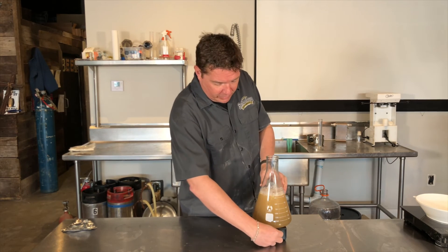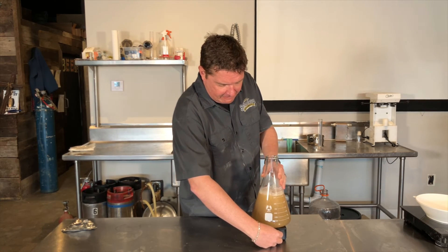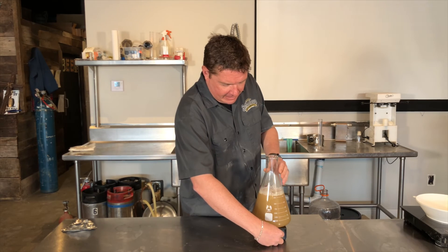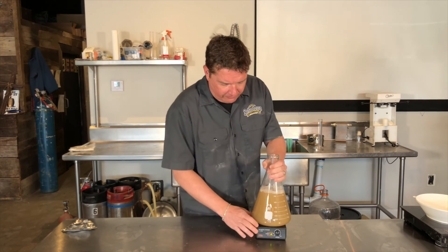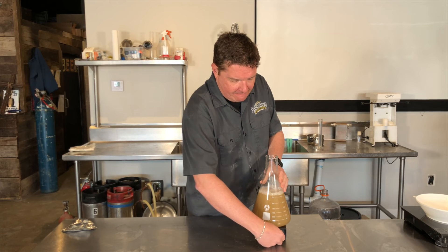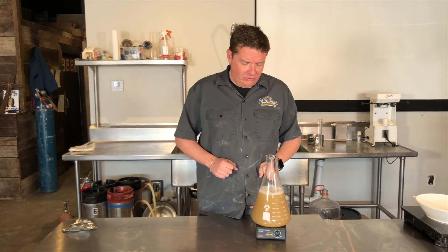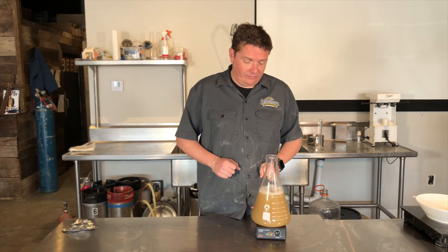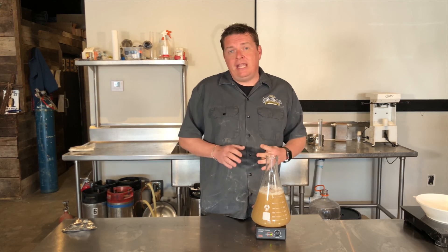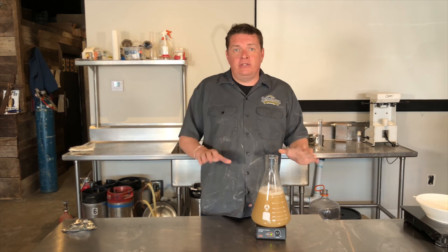So now we just turn this baby on. Sometimes you want to turn it back off, take it off and recenter it — you'll hear it. And in just a few seconds, we'll start getting a vortex. And there you go — your yeast starter is going. In about 48 hours, you're going to have about twice as much yeast to pitch, and it'll be perfect for your brew day.